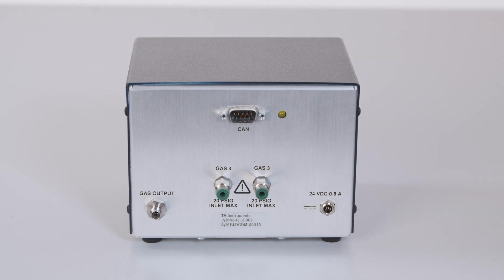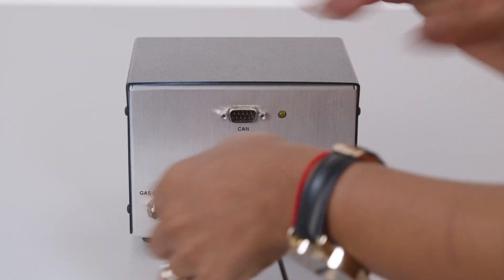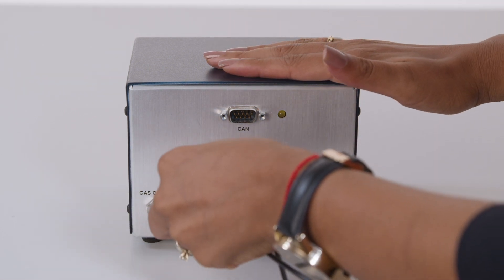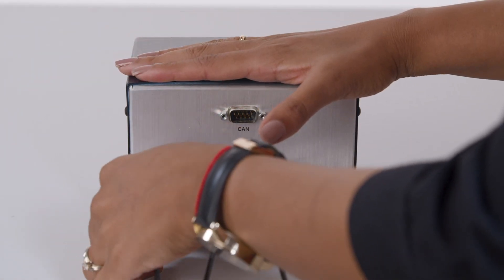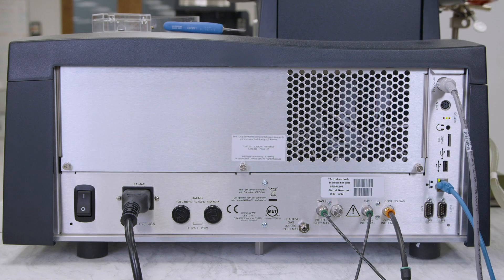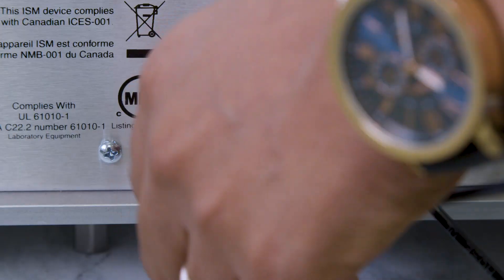To set up the Blending GDM, first connect the input gases to the gas 3 and gas 4 ports on the back of the Blending GDM. Make sure that the pressure of the input gases is regulated to a maximum of 20 psi. Then use the 1/8 inch tubing to connect the output gas to the reactive gas port on the rear of the TGA or SDT.